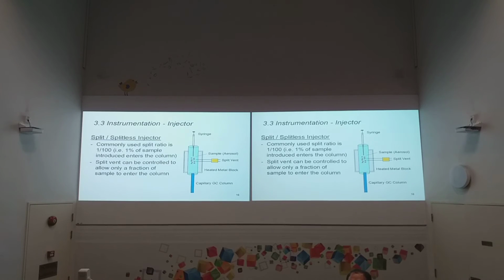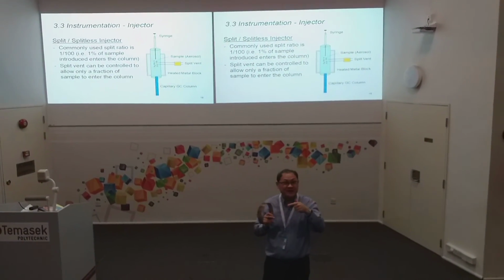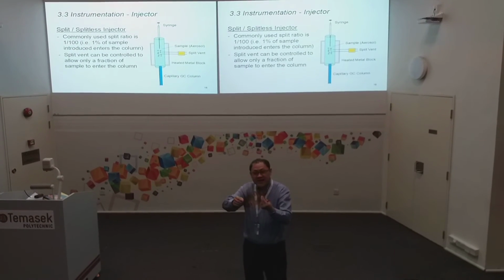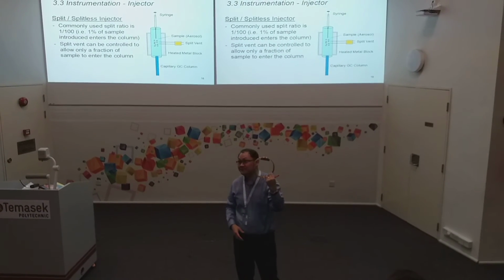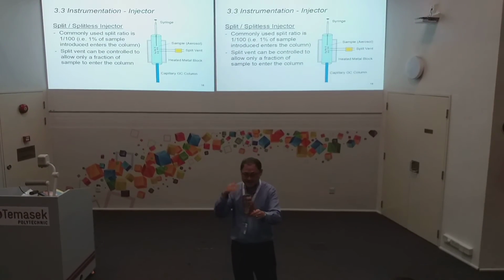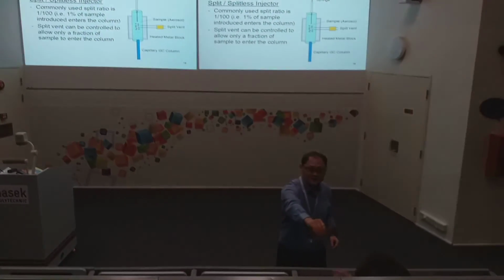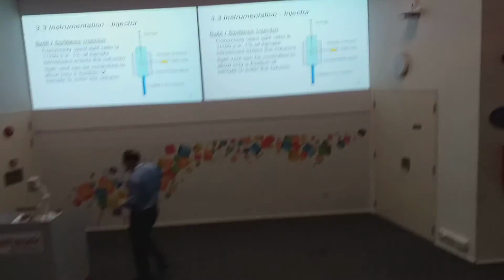You can see this tiny tube, somewhat like just slightly bigger than our hand, right? It's called a capillary column, and we roll it up. The total length of this is the actual GC column. The total length is 30 meters, but it's just small. We just need a small space to house this column. So you pass it around, everybody take a look. Later, when we go into the lab, we still have a chance for hands-on. All right, that's our injector.